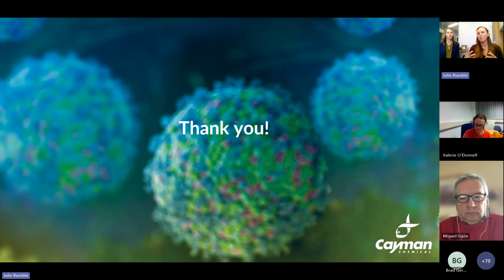The channel size can make a difference. So yeah, I think it's just one more area that you can use to make or test different kinds of LNPs.